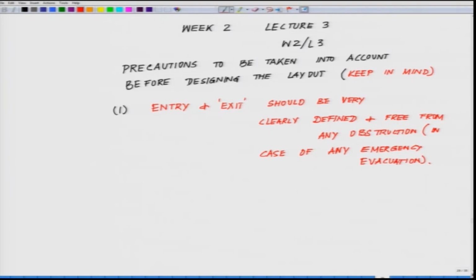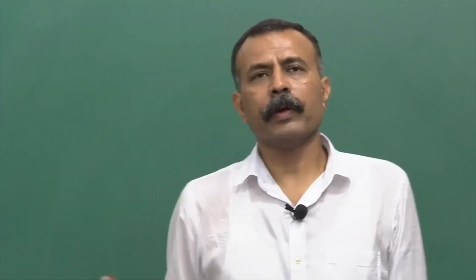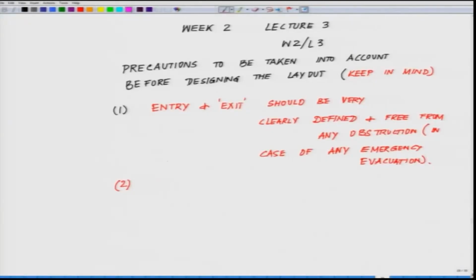Now, the second important thing. In a cell culture lab, I have seen over the years, however much I can put all these things in writing, most of the time when people design them, they forget some of the basic things. Maximize floor area. I will explain what that means.